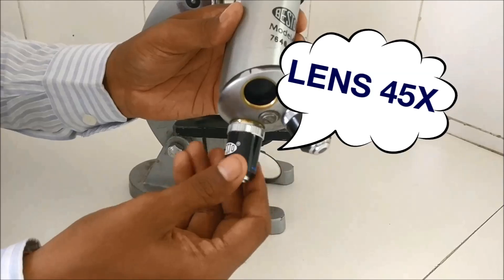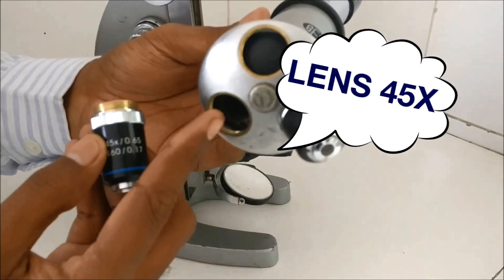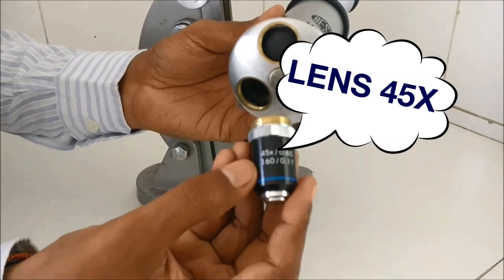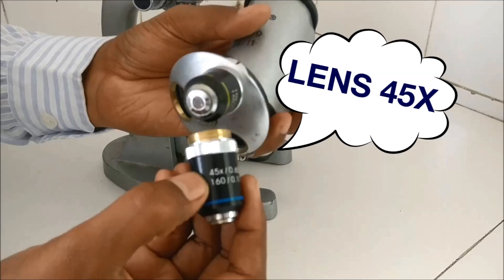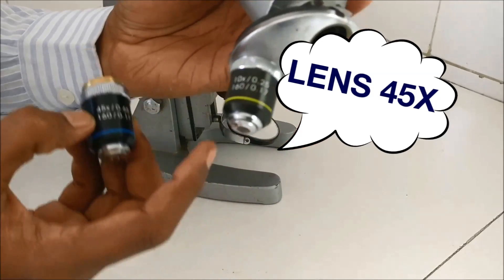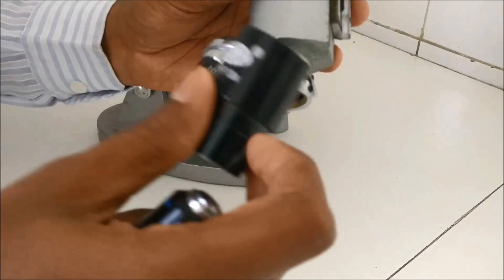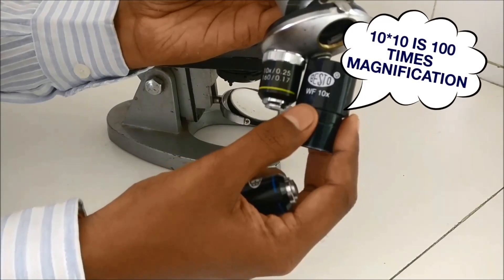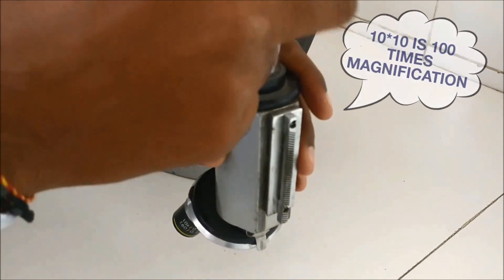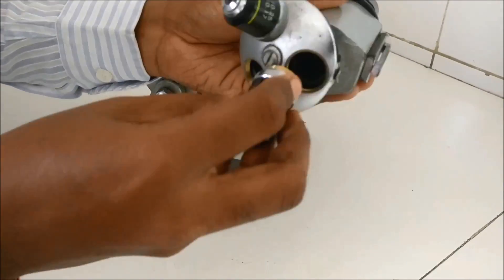What we can see here is the 45x lens, so 45x is high power and 10x is low power. There is one more lens called the oil immersion lens, which is not used at junior college level. With a 10x eyepiece and 10x objective you get 100 times magnification under low power, and 450 times under high power.